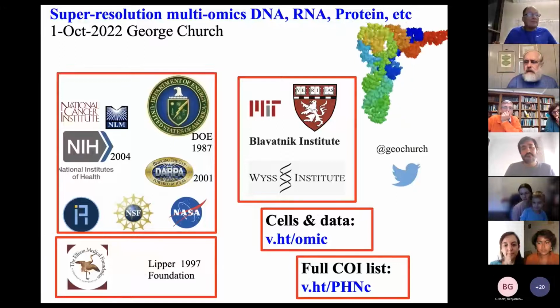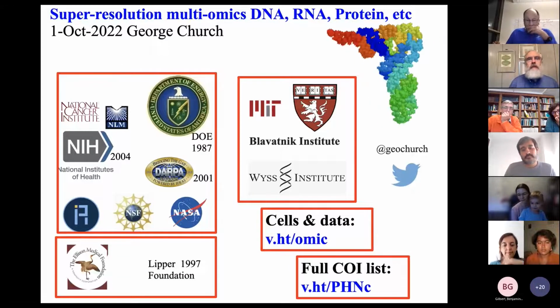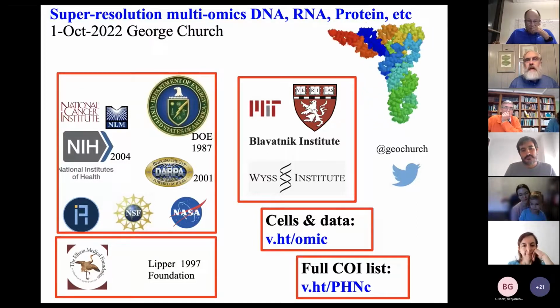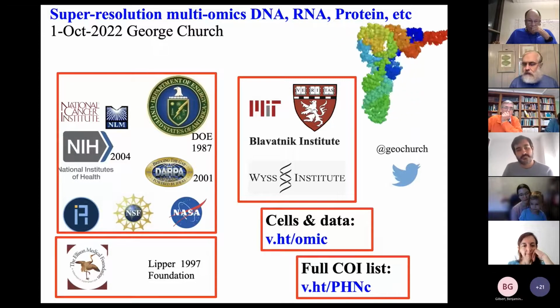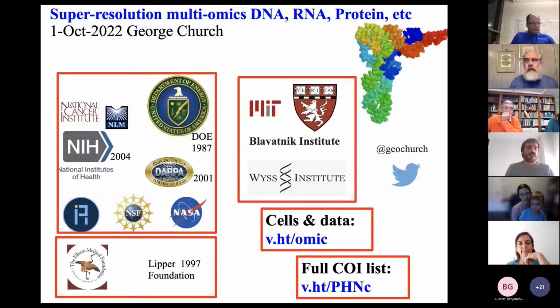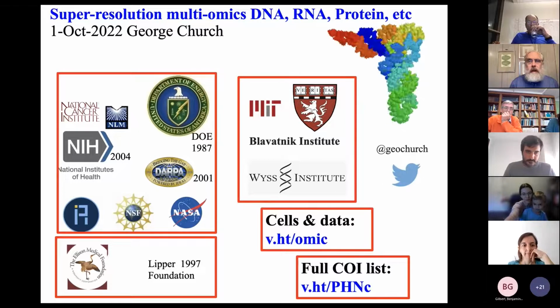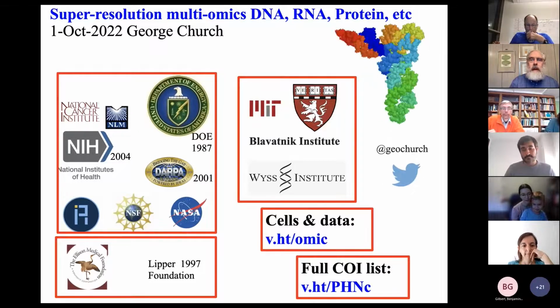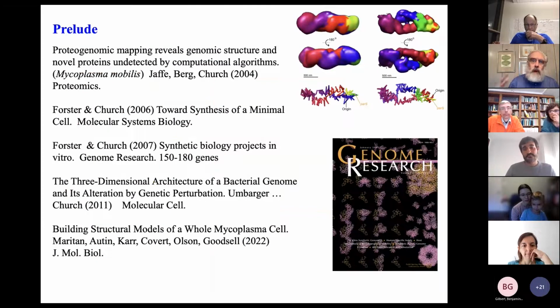I'd like to talk about what we're aiming towards for super resolution multi-omics, DNA, RNA, protein, et cetera, for maybe multiple mycoplasma, starting with the SYN3 type that you're all familiar with. And first, I want to show you where we're coming from, some qualifications.